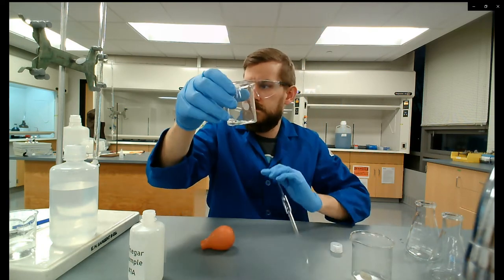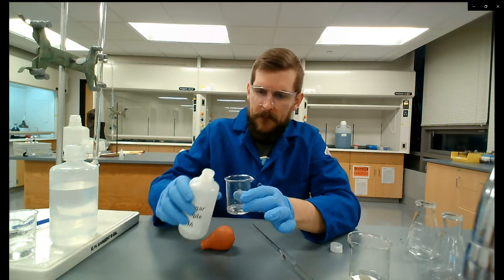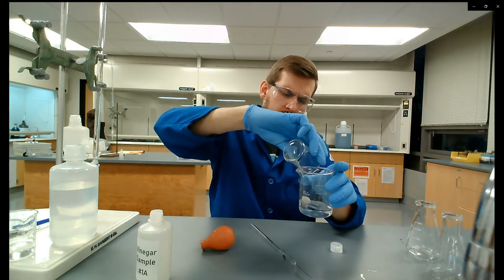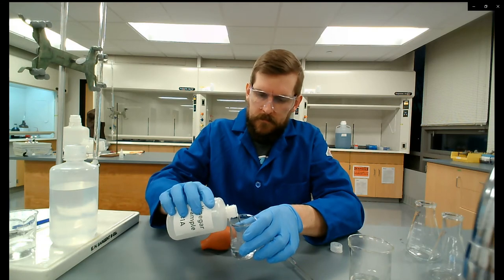This little bit of vinegar I have left I'm going to discard — it's potentially contaminated with whatever we started with. I'm also going to give the beaker a small rinse with the vinegar solution we're actually trying to analyze, and then dump the vinegar sample out into it.